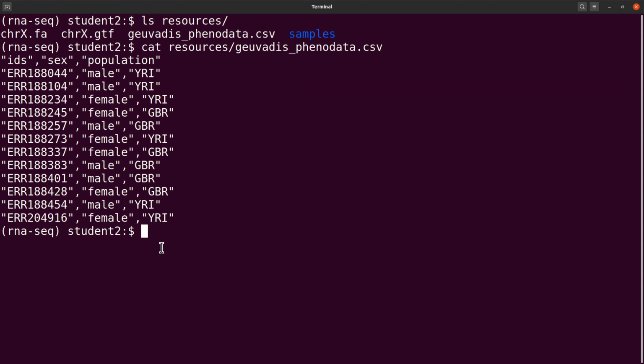And so that is what I thought I would let you know before we begin the actual analysis. But of course, you can also experiment with this, but let's just focus on this particular one here. We will go into details with these ones later on. So these are things you also have to do. Whenever you are going to analyze data, you need to explore and understand your data. And these are things you have to do to get that information. So we are ready to roll. So let's start with the analysis.